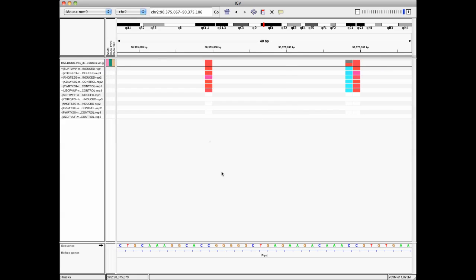For this genomic cytosine, we have output for each sample here, for the plus strand and then the minus strand, induced sample replicate 1 on the positive strand. This genomic cytosine had a methylation rate of 100, as you can see under sample attributes, MR equals 100, and this is represented in red.